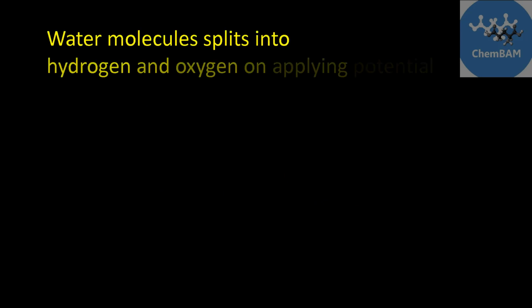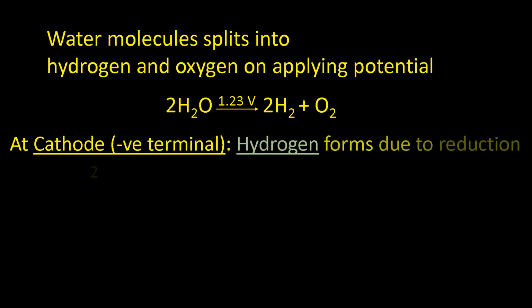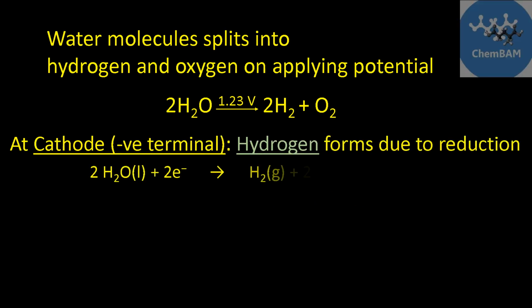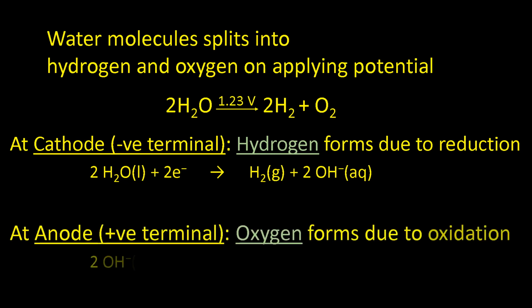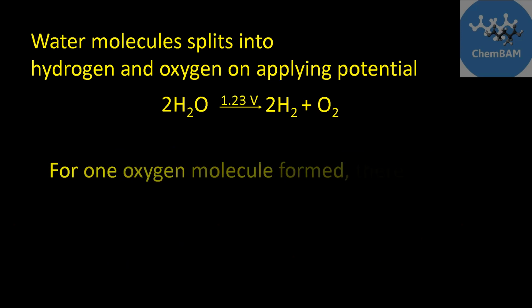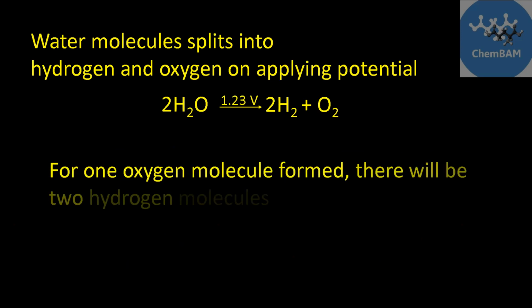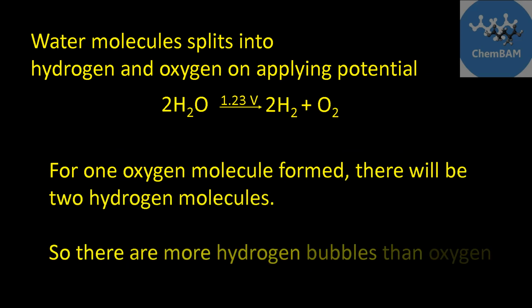Water splits into hydrogen and oxygen when a potential is applied. At the cathode, hydrogen is formed, and at the anode, oxygen is formed via the following reactions. When the reactions are combined, we can see that two water molecules split into two hydrogens and one oxygen, and therefore more hydrogen bubbles are formed than oxygen bubbles.